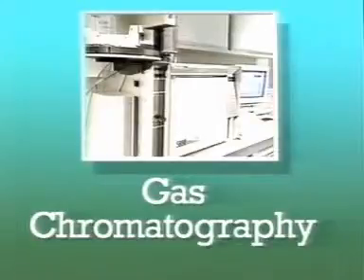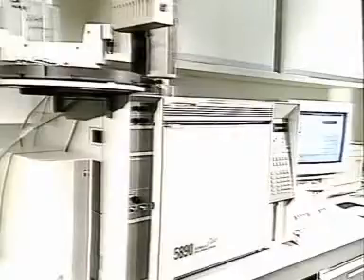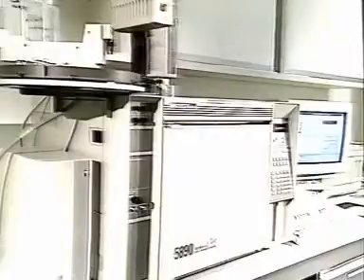Volatile or can be made so. One important use is to determine whether a newly prepared compound is contaminated by solvents. The separation takes place inside an oven which is used to maintain a controlled temperature.